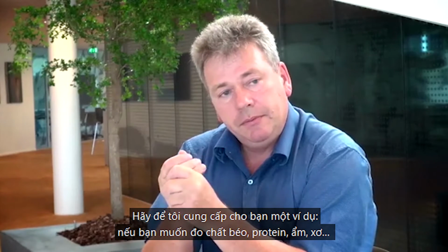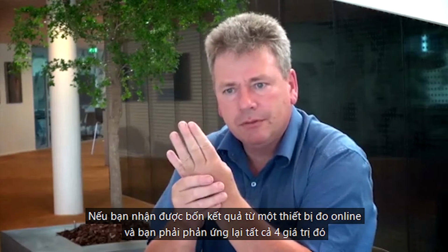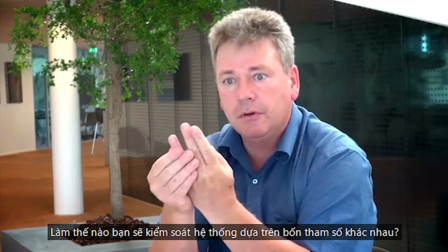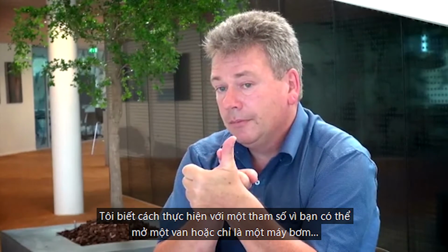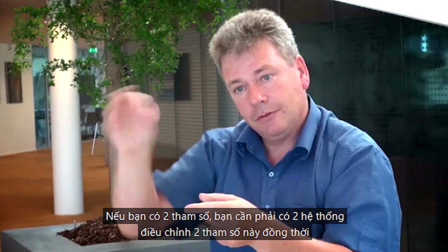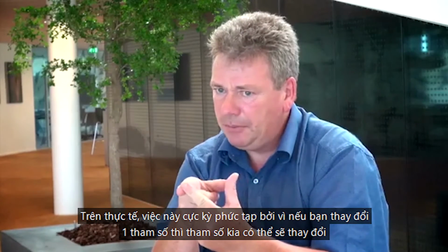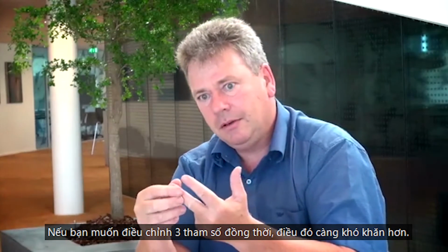Let me give you an example. If you want to measure moisture, protein, fat, fiber and so on, and you get 4 results out of an inline instrument and you have to react on all these 4 results, how would you control the system based on 4 different parameters? I know how to do it with 1 parameter, because then you can open a valve or adjust the pump and stuff like that. If we have 2, then we have to have 2 strings in to adjust both total solids and fat, for instance. And that's very complicated, because if you just add a little bit of this, then you change this one. They are not independent. And if you take number 3, then it's not going to be easy.